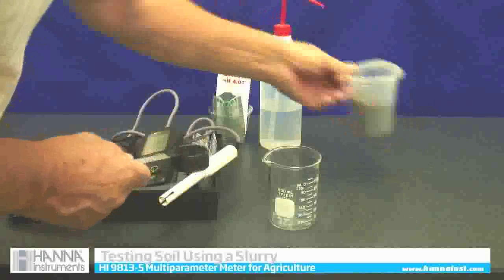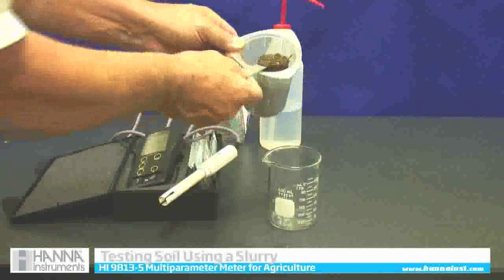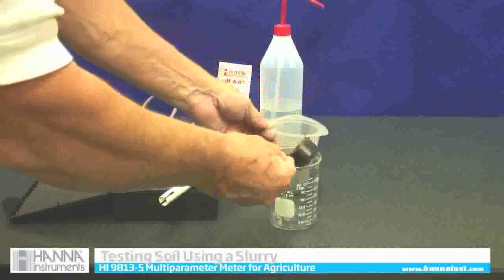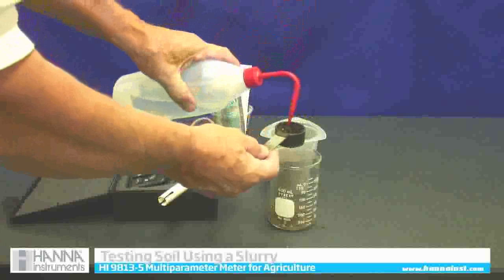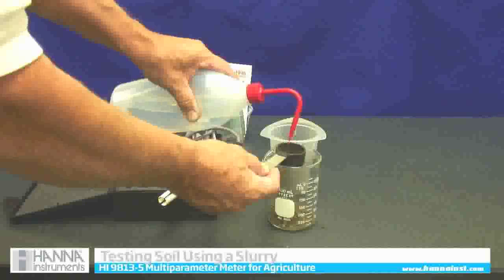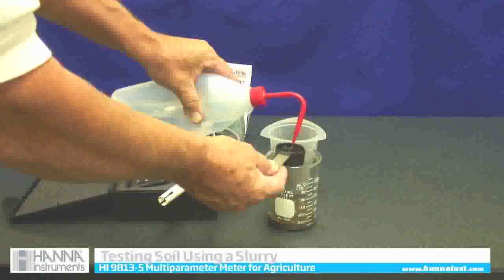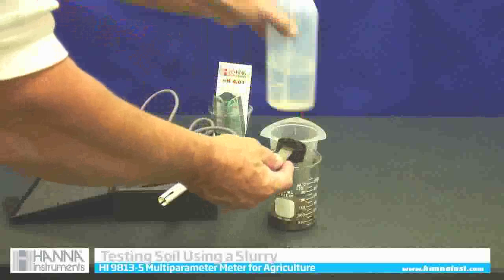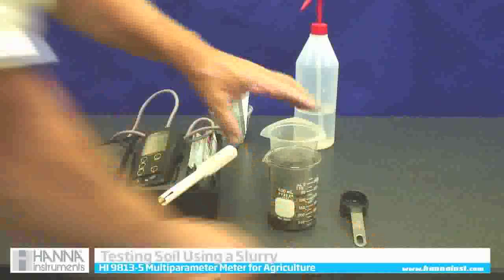The standard ratio we use is one part soil to two parts distilled water. I'm taking one part of soil and blending it with two parts distilled water — this bottle here contains the distilled water. So that's one part soil, two parts distilled water.